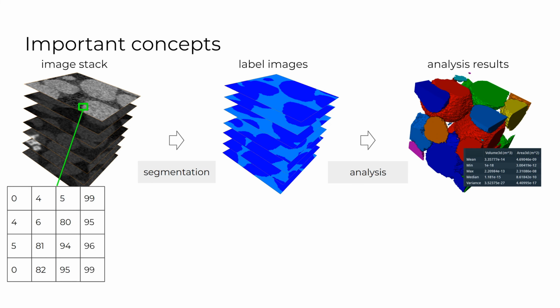Right? And I mean, there's a wide variety of applications, right? So this is just one example. You could be working with biological data, some rock samples, some membranes, etc., right? But you somehow would have a similar workflow. So you have your data, you do segmentation to separate the materials, and then run some analysis. So this is what we'll be focusing on today.